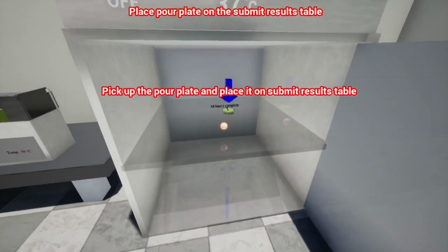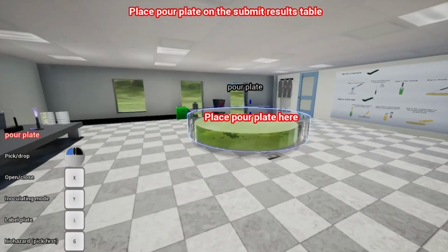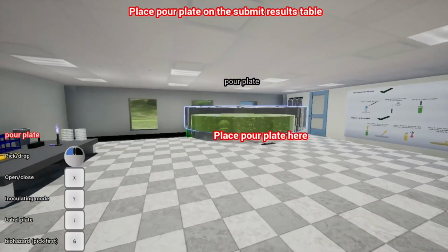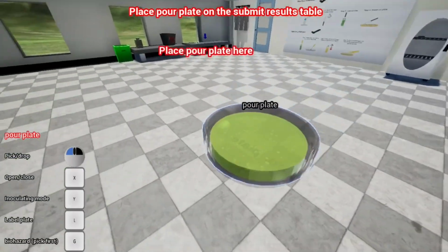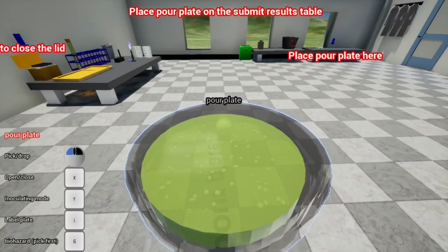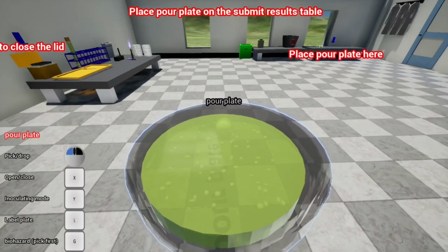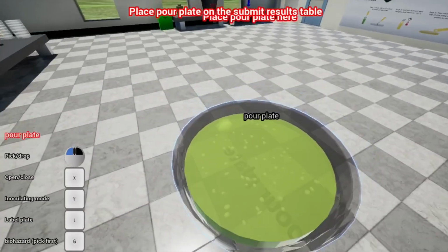And again, see the difference between streak plate and pour plate is that when you do pour plate, the bacteria is growing within the agar, not on top of it. And you can see that all the colonies are not perfectly round. They are different sizes, basically the agar restricting growth from each side.